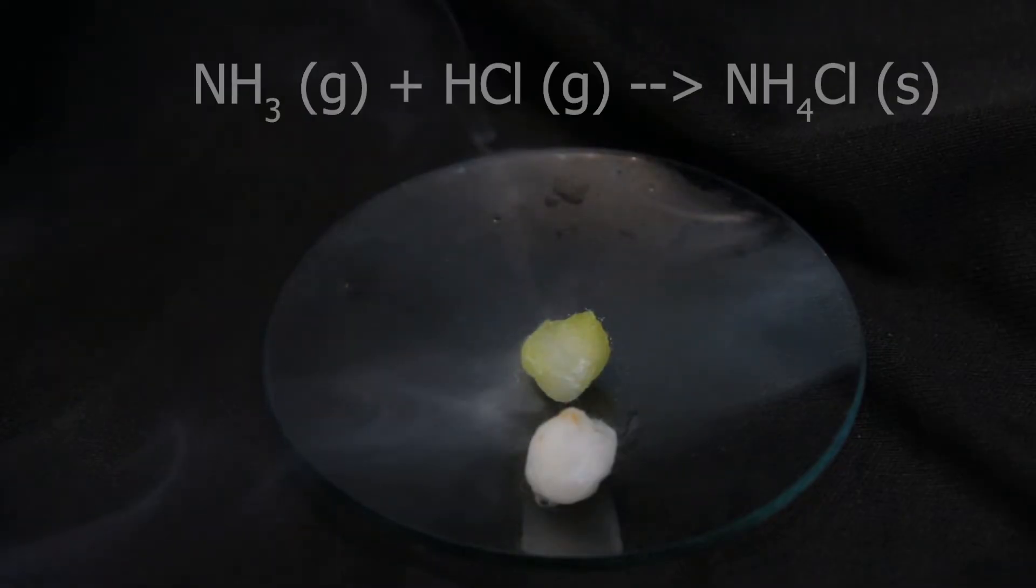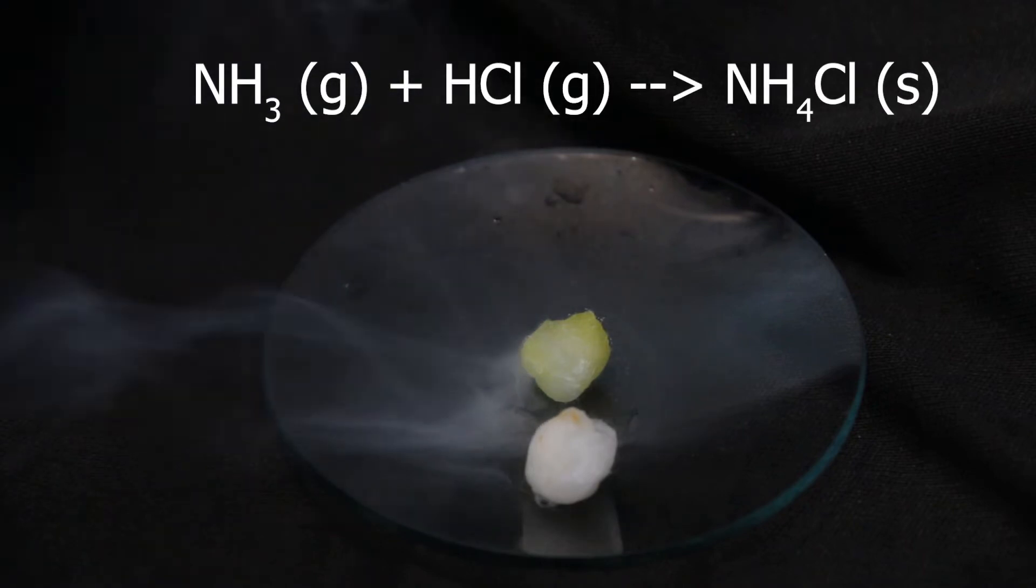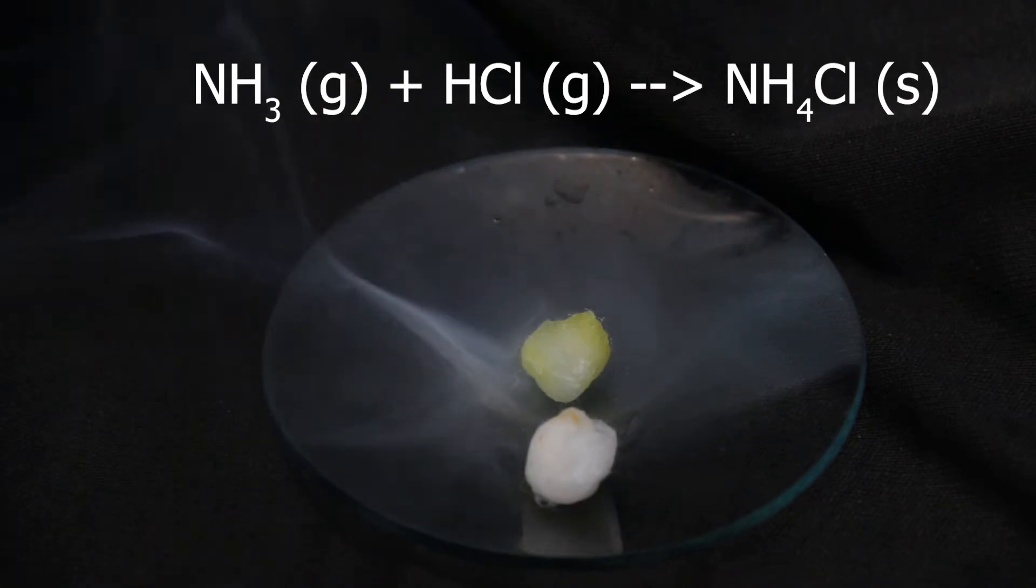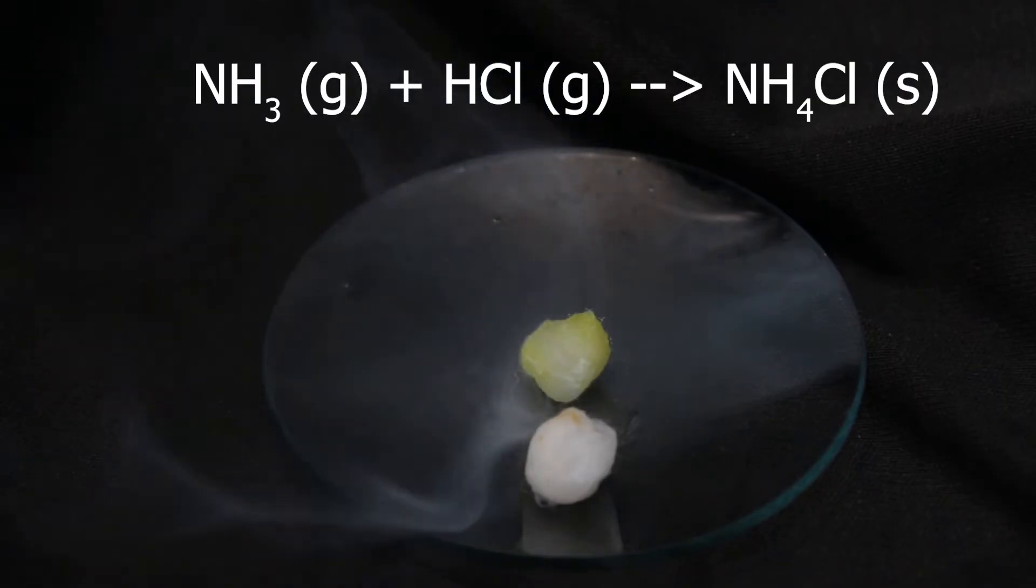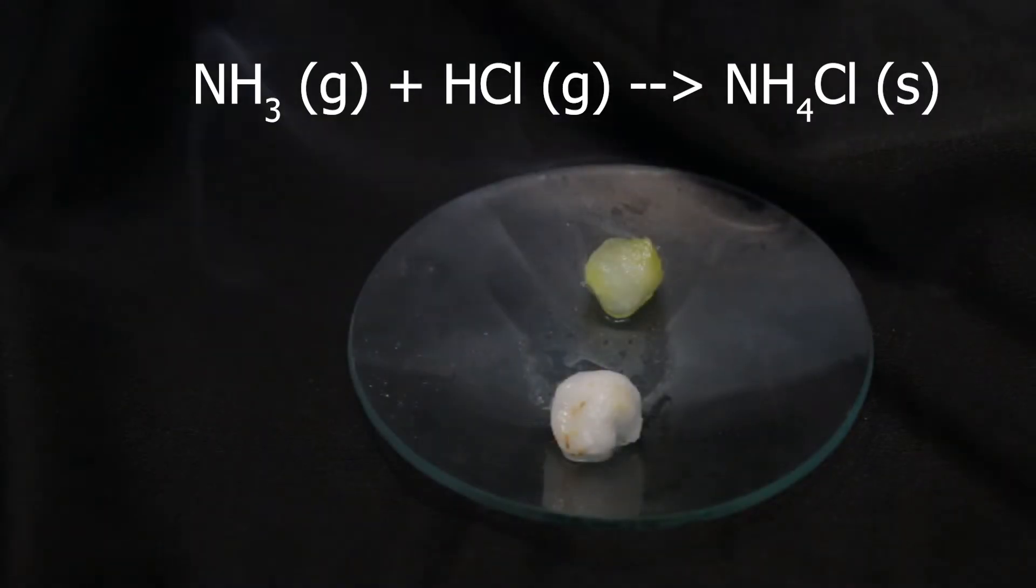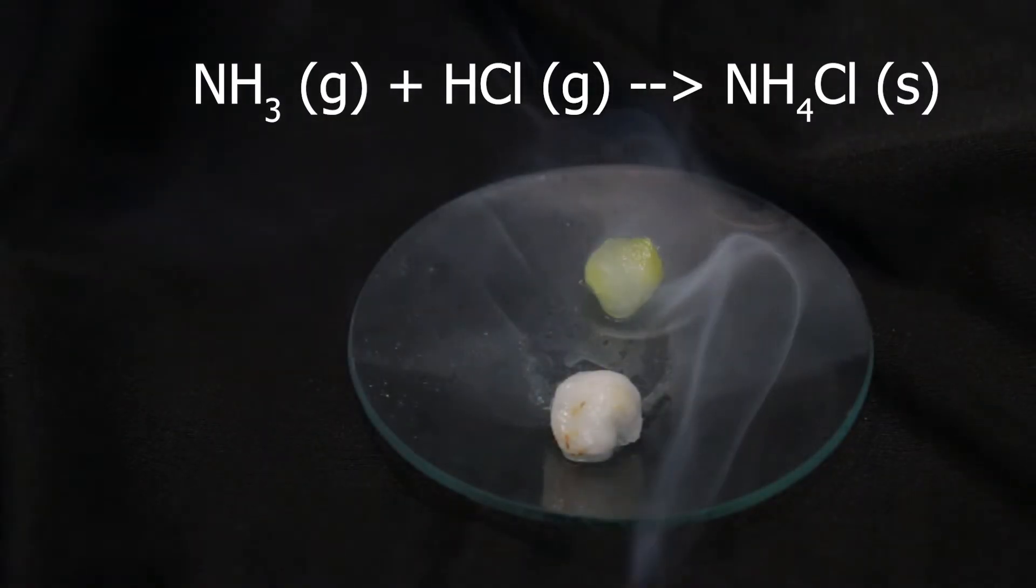You see, there are two gases. One is NH3, which is alkaline, and another is HCl, hydrogen chloride, which is acidic. They react together, forming a salt. It's quite a normal reaction. Simply, it's interesting because it takes place without participation of water.